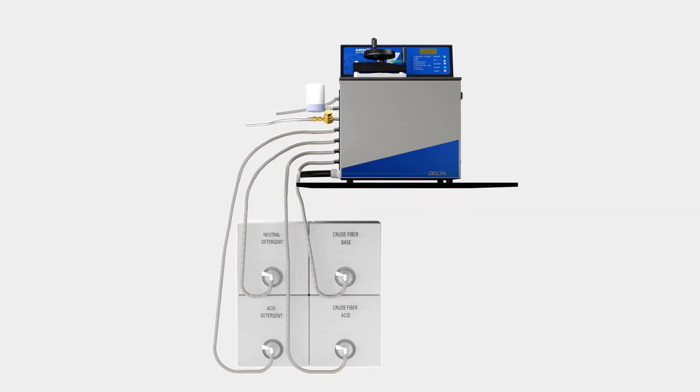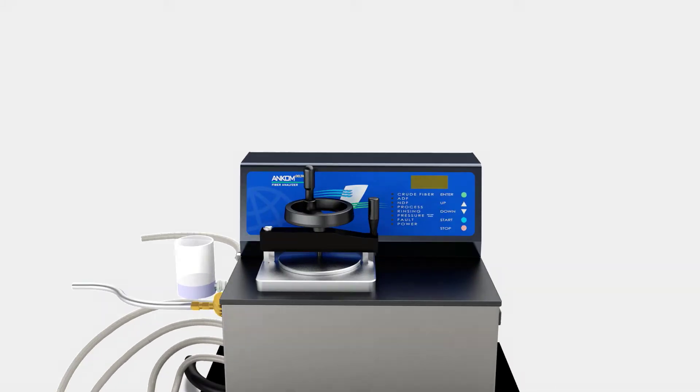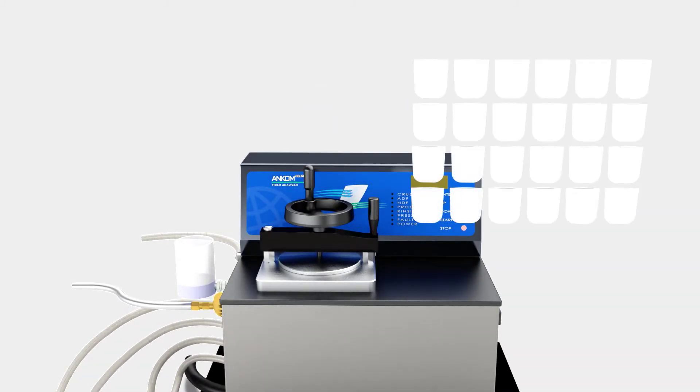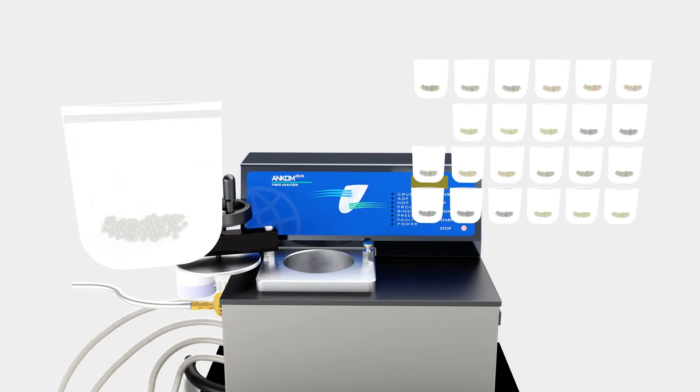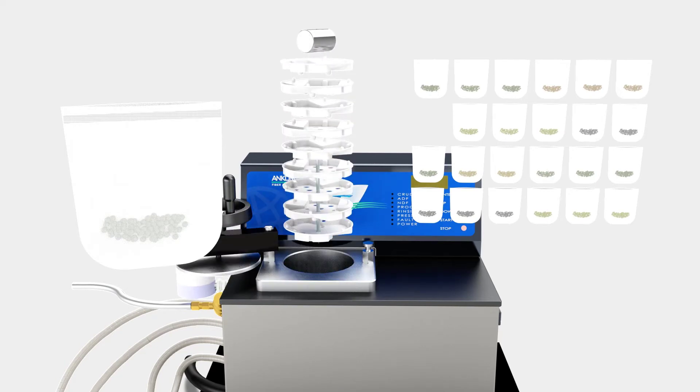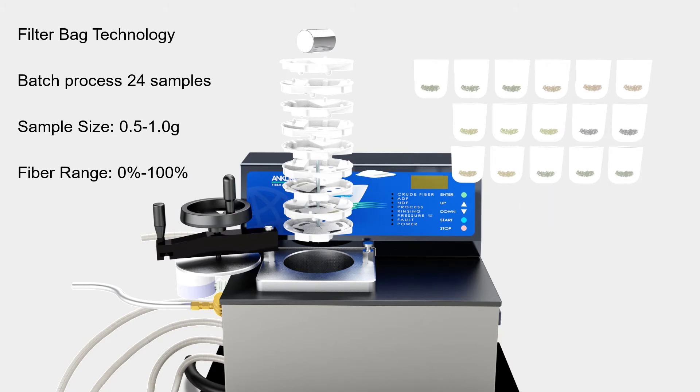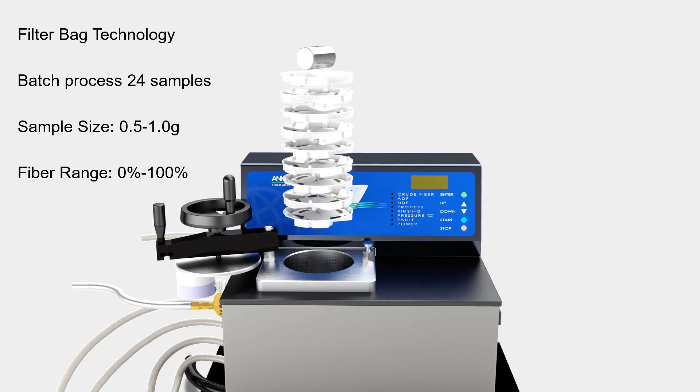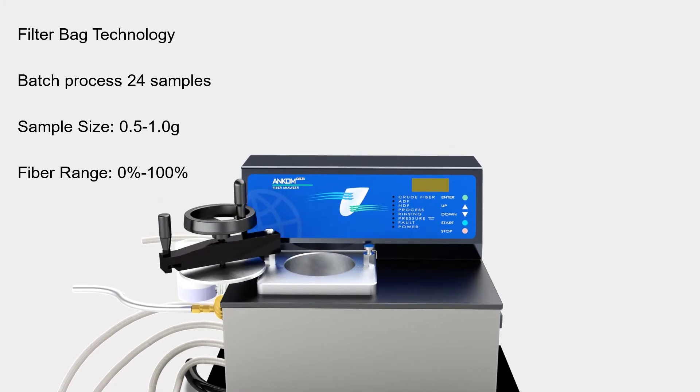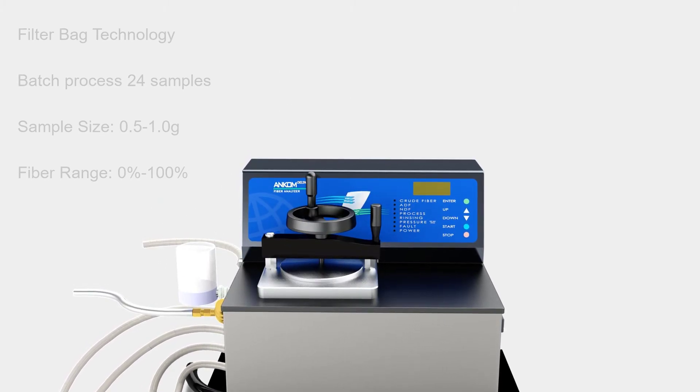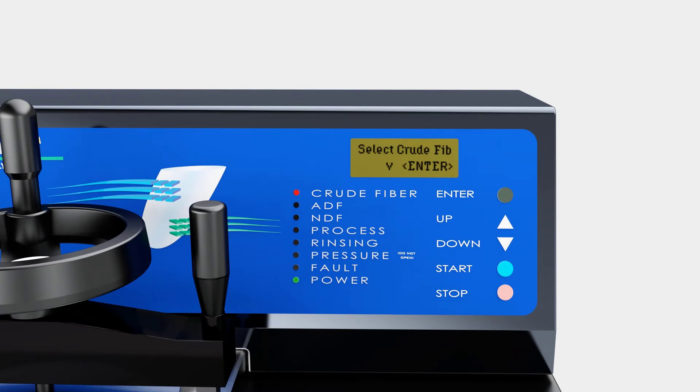Up to 24 samples are prepared and encapsulated in filter bags. The filter bags with sample are sealed, placed in a bag suspender, and placed into the fiber analyzer's vessel. After the user closes the vessel lid, they follow simple screen prompts to select the desired method and start the run.